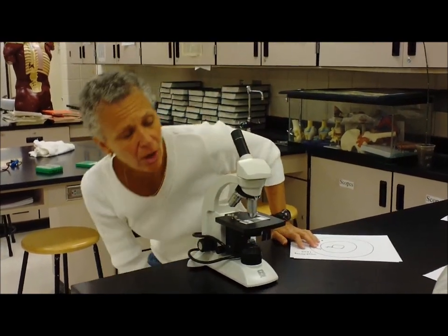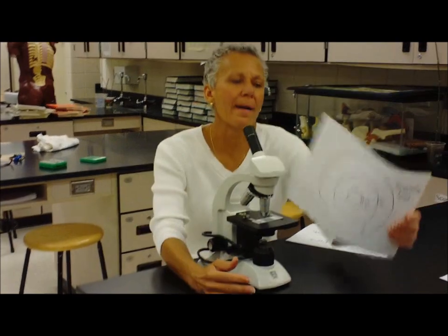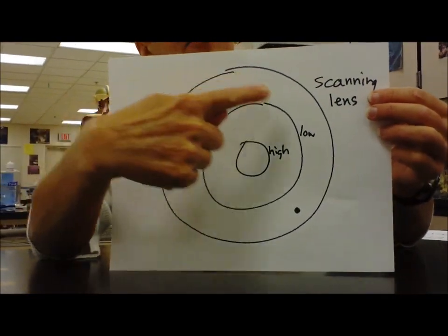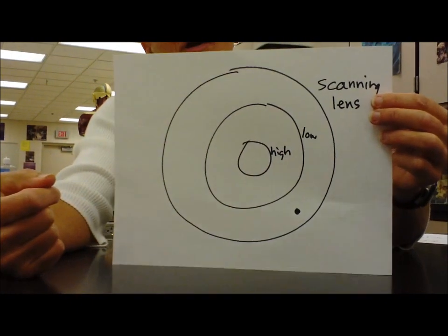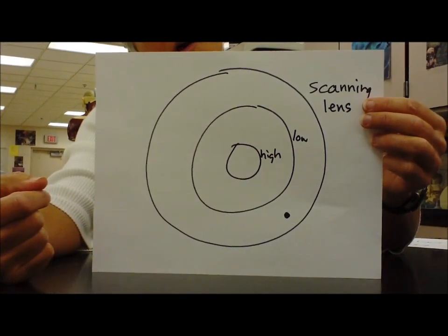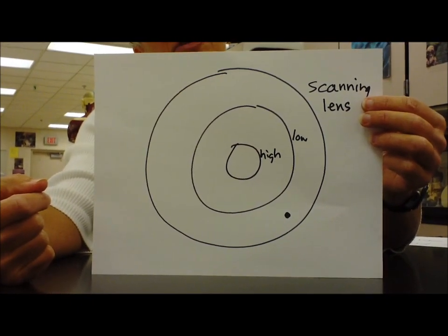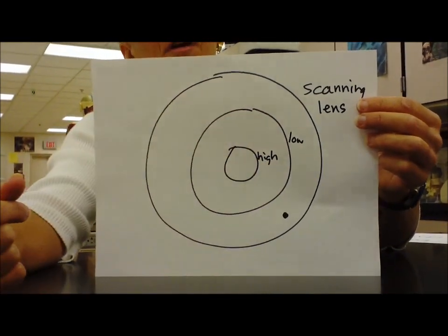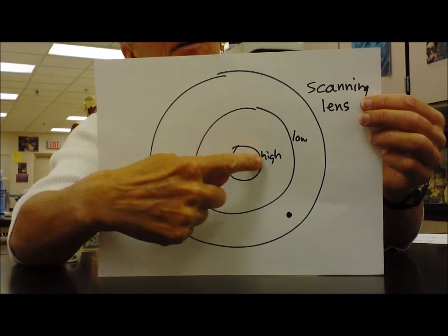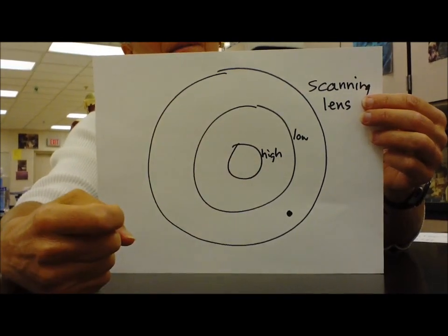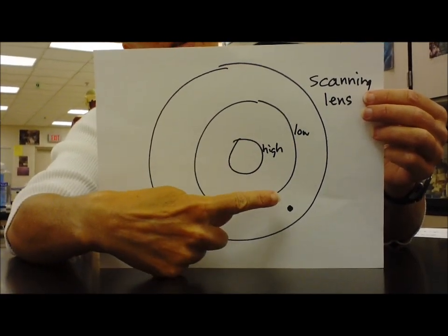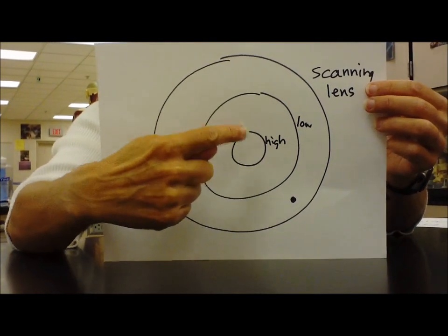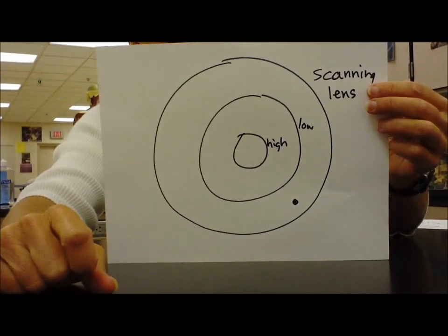Why is it important to center your object? Well here's why. On the scanning lens, you see everything in the outer big circle. As you move to the low power lens, you see less distance. You're only going to see what's in the second circle. And under the high power lens, you only see what's in the very center. So if this is your object under the scanning lens, and you don't move it at all, it will seem to have disappeared when you go to the higher powers.